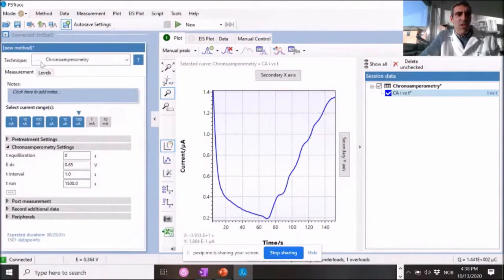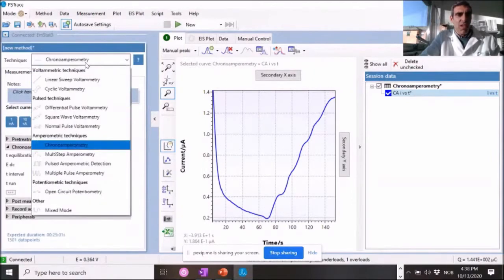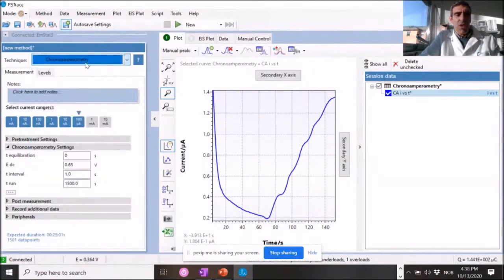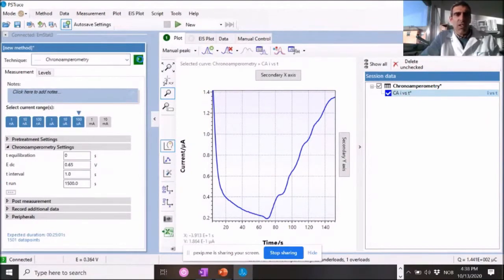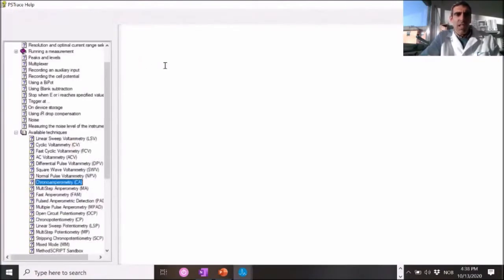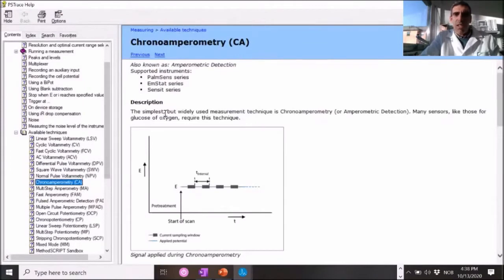Once this is done, we use a chronoamperometry technique. So we have several techniques. If you have any questions about the technique or want to investigate a little bit further, you can use this question mark. It's very nice and it will explain exactly what this technique is doing.